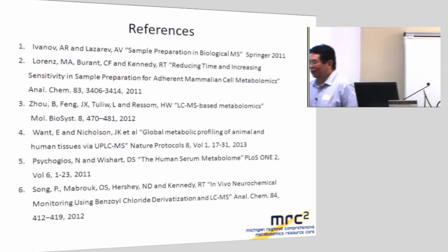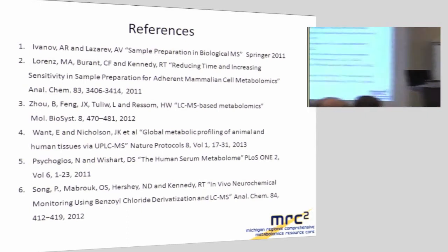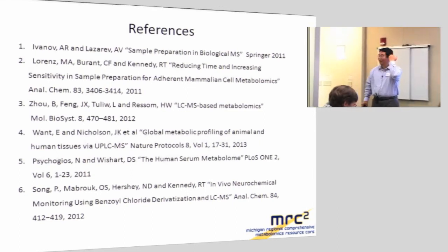Yes. You recommend rinsing cells with water, 10 milliliters. But it should cause osmotic effects and actually change the concentration of many metabolites, and even transport of some osmolytes from cells to the outside medium. So I think this method can disrupt the metabolic profile dramatically. Well, it is very fast. It is a couple of seconds, a quick wash. Seconds is enough for transport.